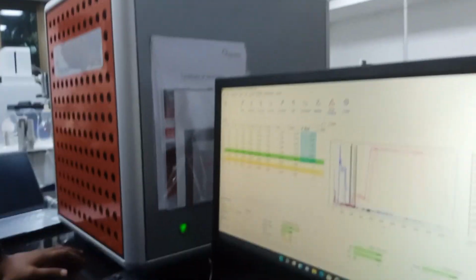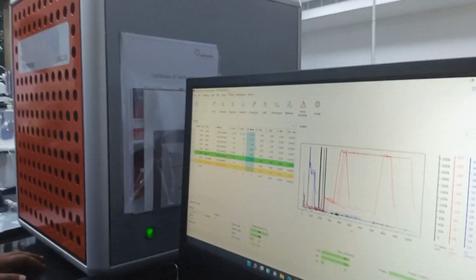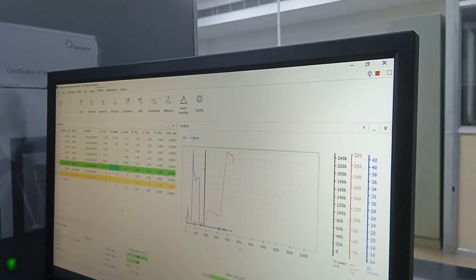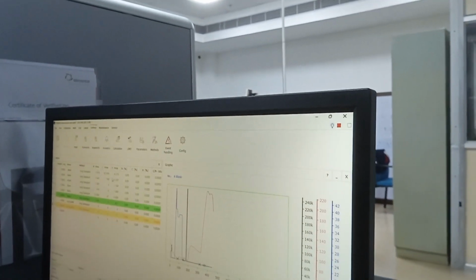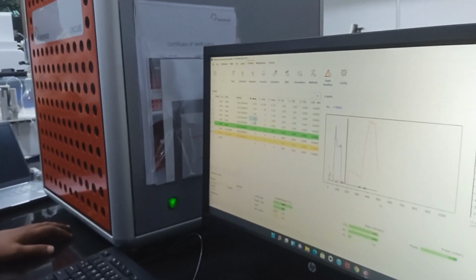So these blanks, whatever you are getting, will be below 100. Like this, zero it will come for nitrogen. But here the values are more than 0. Now here you can see 1,000, 800. It is not that pure. Once it is getting 10,000, here 4,000. Can't rely on it.